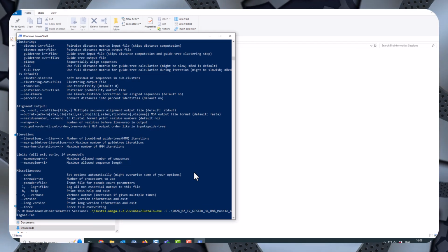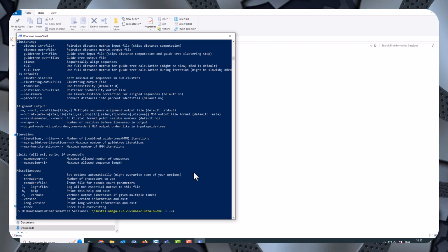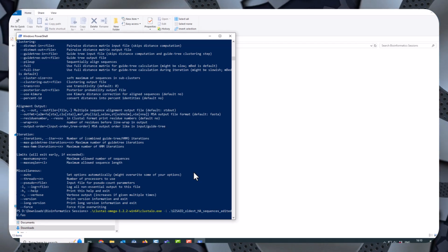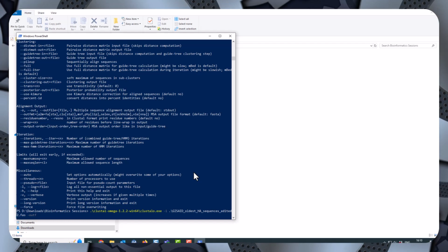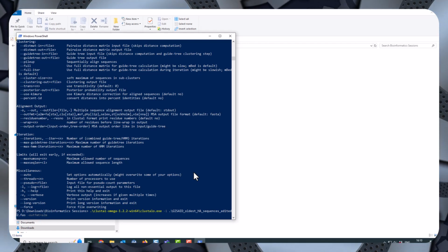Name of the file. I press the tab key to automatically complete. Unfortunately, it's automatically completed, giving me the wrong file name, because I want the input file name without it being aligned already by Muscle. Then I want to type this output format command. Now I need to remember here, and I haven't remembered, and I need to double check.